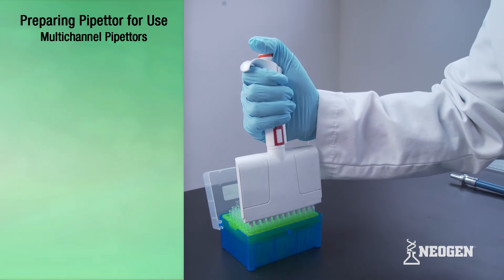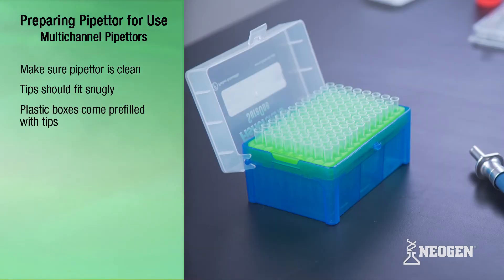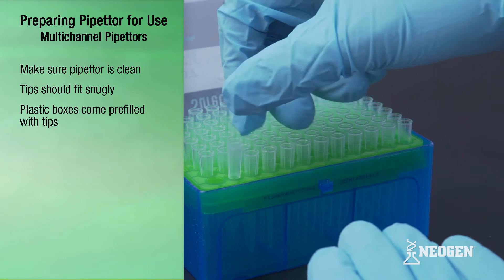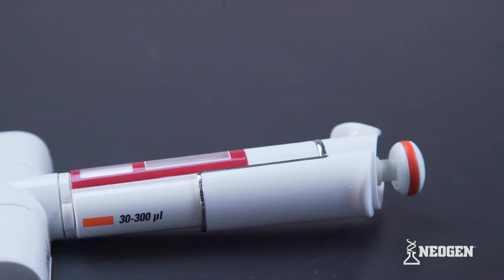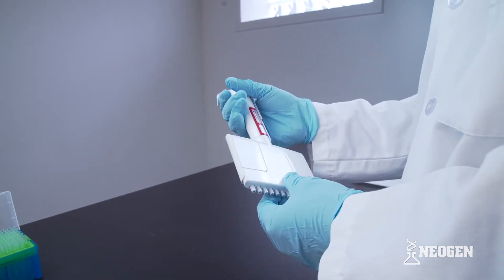The pipetter should also be clean on the outside and tips should fit snugly into the pipetter. Plastic tip boxes come pre-filled with tips, and a common practice is to manually refill boxes from bags of tips. When refilling tip boxes, be sure to wear new disposable gloves. Once the correct pipetter and volume is selected and functionality is verified, the pipetter is ready for use.